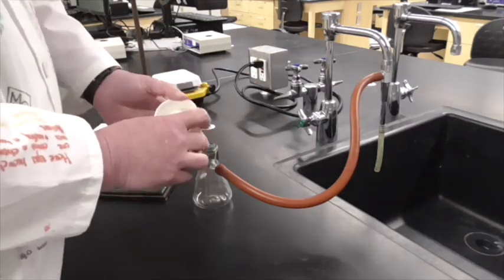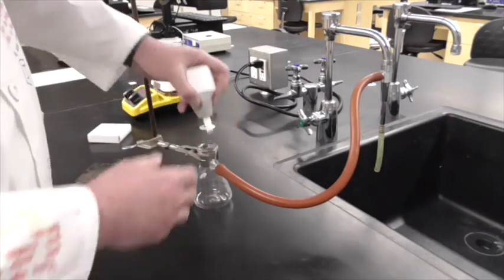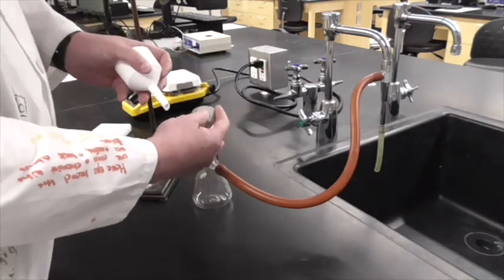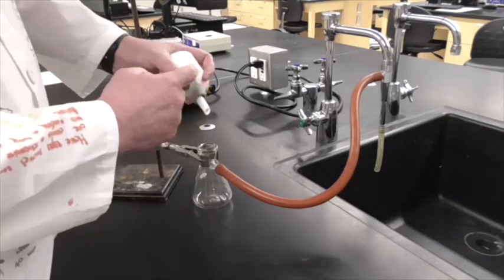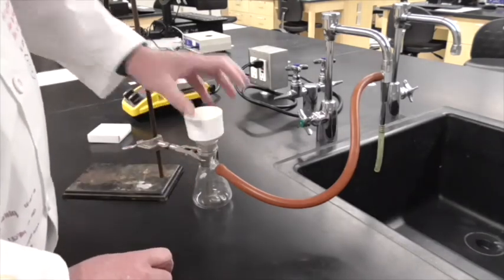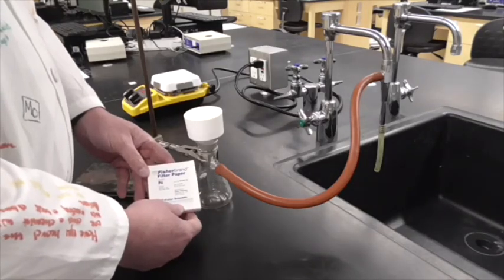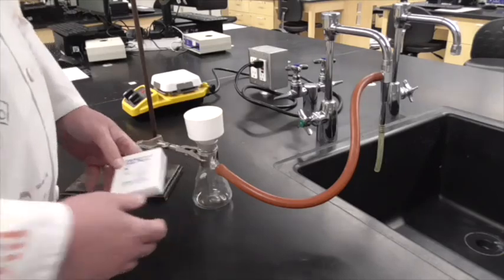Our filtering apparatus, our filter funnel, is just going to go on the top here. It's got a little rubber adapter to make a nice seal between the filter and the sidearm flask. And the last thing we're going to need to do is weigh some filter paper. So we'll do that next.